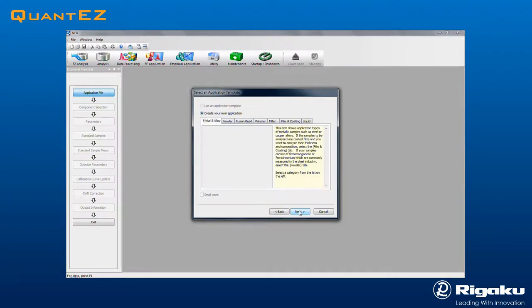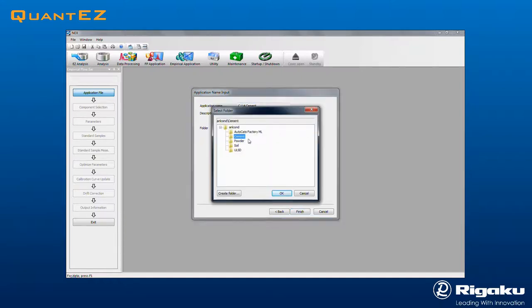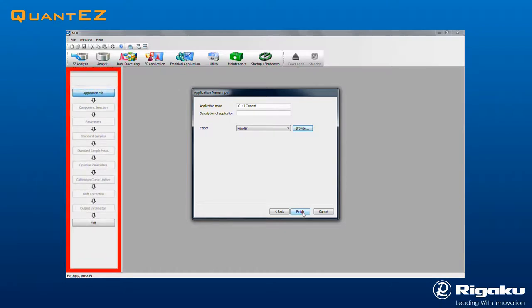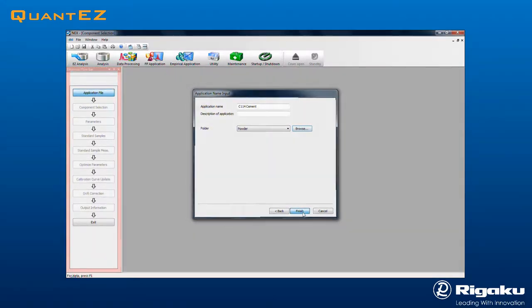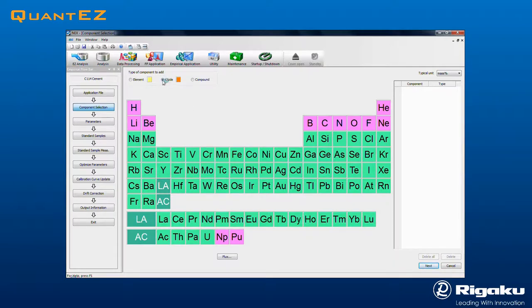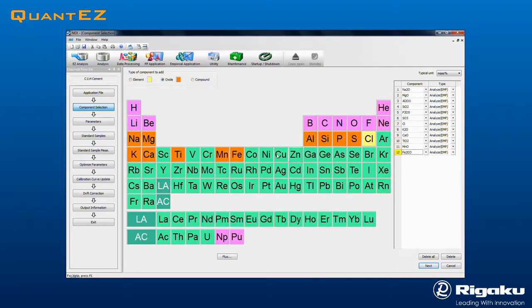The powder category is chosen for this cement example. Type in a name for the application, select a folder for data storage, and then click Finish. Note how the left side flow bar guides the application setup process. In Components selection, analytes are selected as either oxides or elements. Note that most components in cement are oxides.